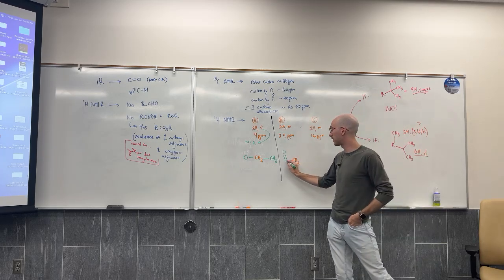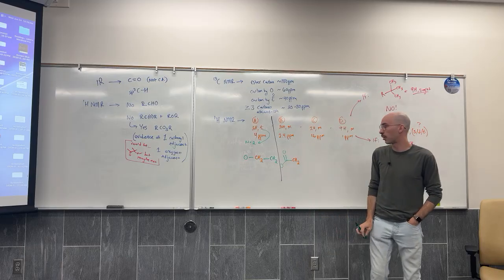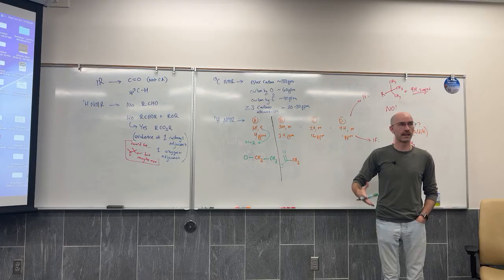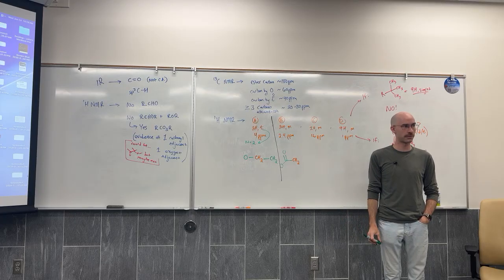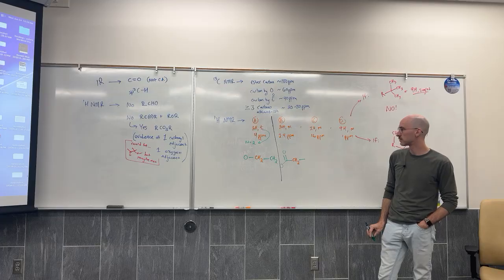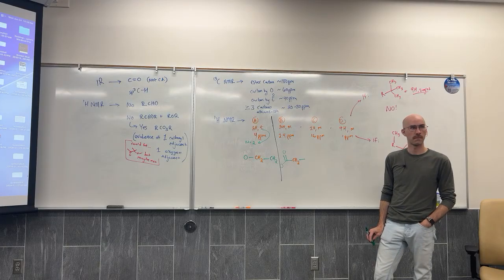And we know that this carbonyl is an ester. How do we know that? Again, the combination of IR and NMR is suggesting to us that we have an ester. To its right, I don't know.